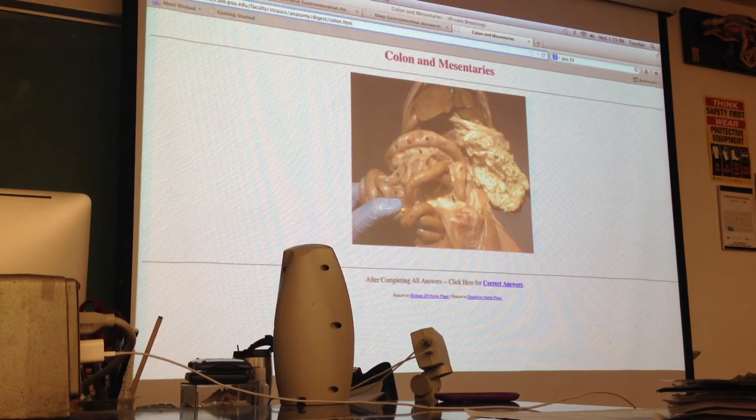Now for the rectum, you're going to identify it because it's essentially going to be the portion of the large intestine that you see right before it goes into the lower, basically like the hip muscle wall. So you have that wall of muscle down at the bottom. Right before the large intestine leaves, we pin it right there. So the very, very end of it, essentially. And then the anus we pin externally, so we literally just pin the anus right next to the tail.